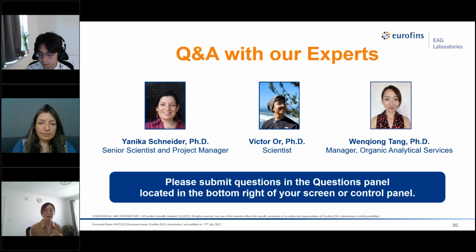effective techniques, including GCMS. We have successfully utilized GCMS, which stands for gas chromatography mass spectrometry, to quantify different types of antioxidants like the sterically hindered phenols in the polymers. Or if the antioxidant of interest is too high boiling and doesn't really fly in the GC, we have liquid chromatography mass spectrometry, LCMS, that can also be utilized. Both of those 2 techniques offer much better detection limit compared to FTIR.